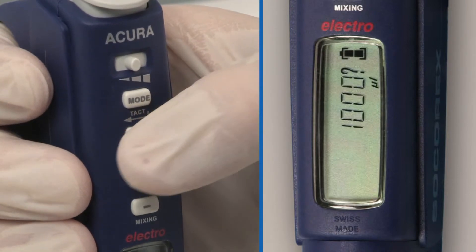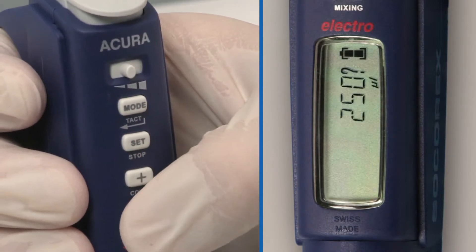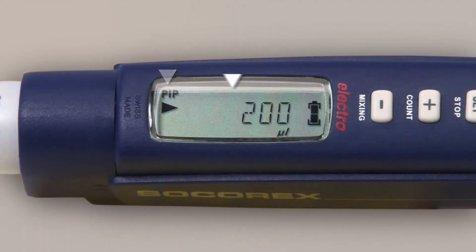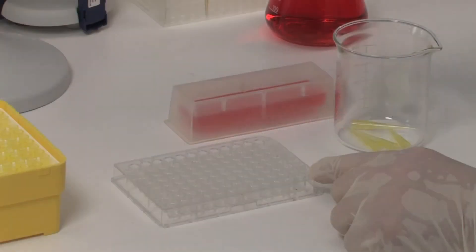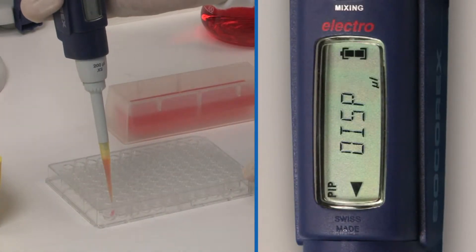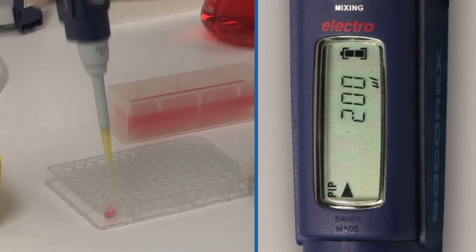Press set to validate. Press the plus/minus keys to display the desired volume. Press set to validate. The display shows the selected mode and volume, and the instrument is ready to aspirate in forward pipetting mode. Aspirate the liquid, and the display shows that it's ready to distribute. After distribution and overshoot, the display shows it's ready to aspirate again.